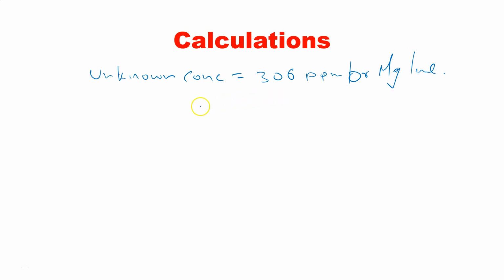And now if you remember, when we did the extraction, I consider that it was 1 gram, and in that the 2 normal HCl that I added was almost 10 ml. These values may be changed in your experiment. I am just giving a demonstration that you need to understand. So roughly it will be, suppose, 11 ml, almost I have considered, and from this we have taken only 1 ml for further extraction.